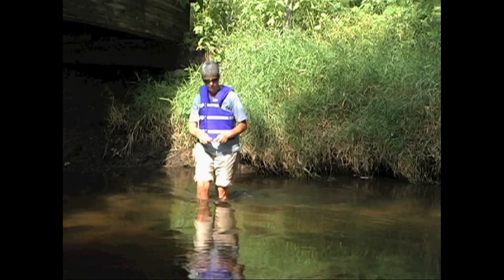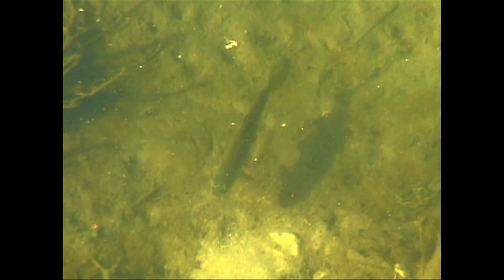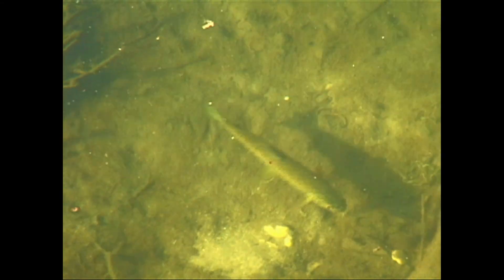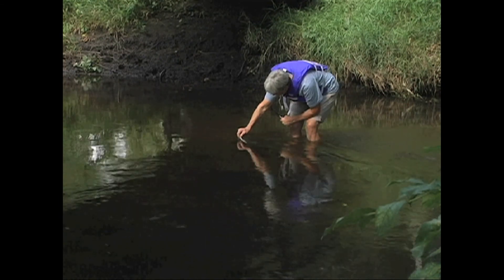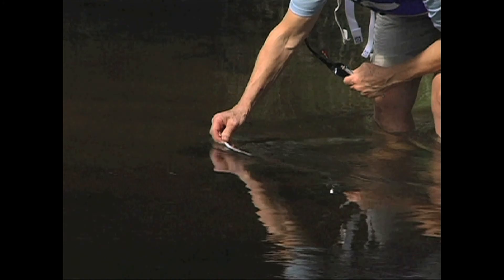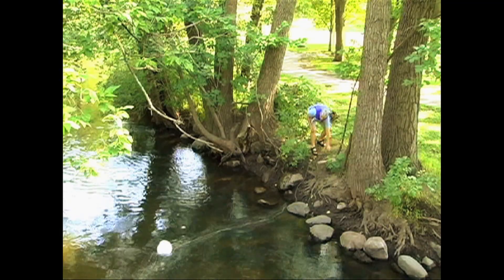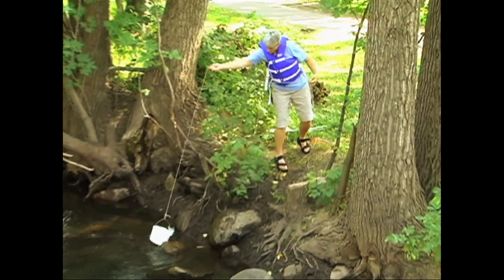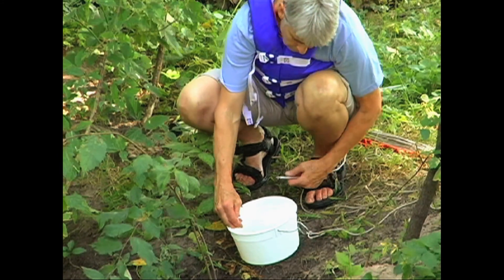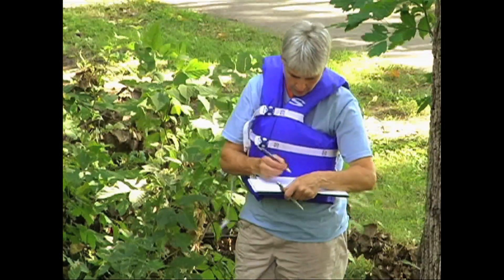If you want to, you can also take temperature readings on your river or stream. This is particularly important on trout streams, where trout need cool water temperatures to survive. Use a thermometer that doesn't contain mercury — then, if it were to break, it wouldn't put mercury contamination into the stream. When possible, take temperature readings by holding your thermometer directly in the stream for two minutes. Write the temperature in degrees Fahrenheit on your stream data sheet. If you can't put the thermometer directly into the stream, collect a bucket of water from the deepest and fastest flowing part of the stream. Stir your thermometer in the water sample for two minutes immediately after it's drawn. Write down the temperature reading in degrees Fahrenheit on your stream data sheet.